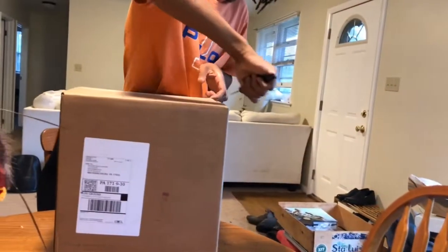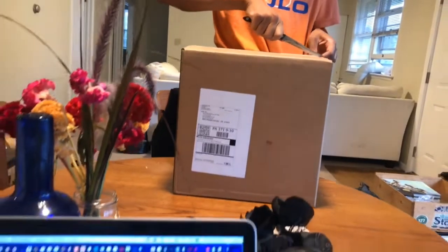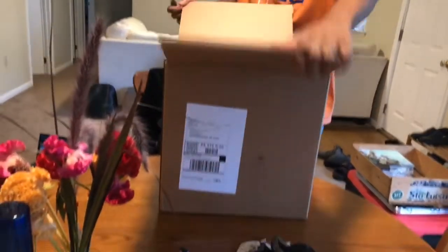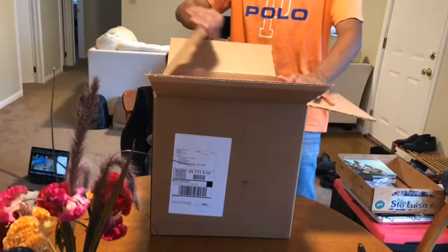Super stoked on this. Gonna start sequencing Cordyceps mushrooms that we find in the wild. Also going to do sequences of the insect hosts that we find, because a lot of times we can't even identify them.